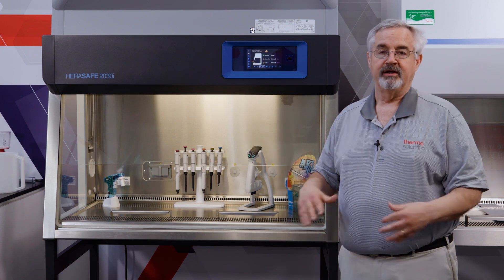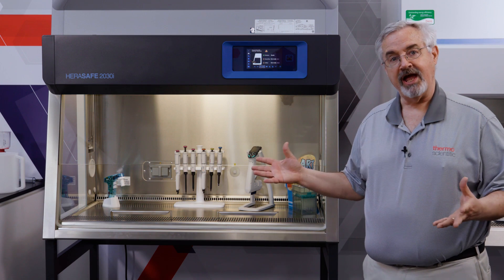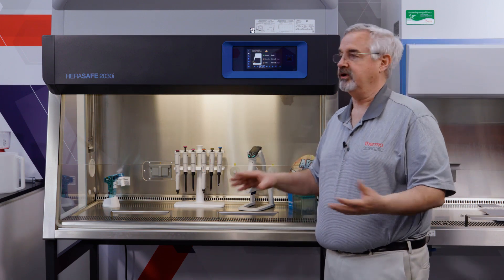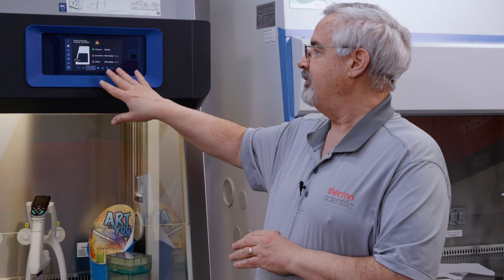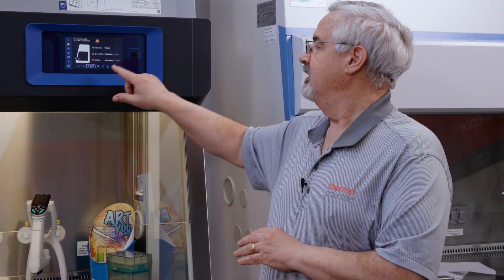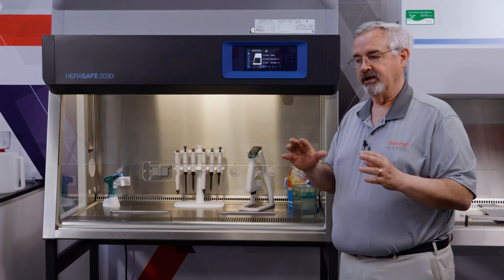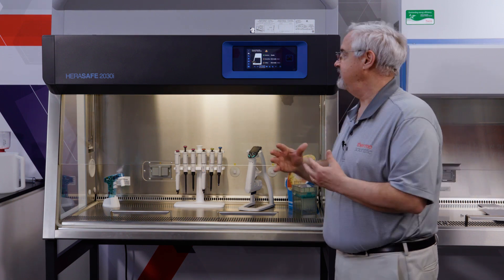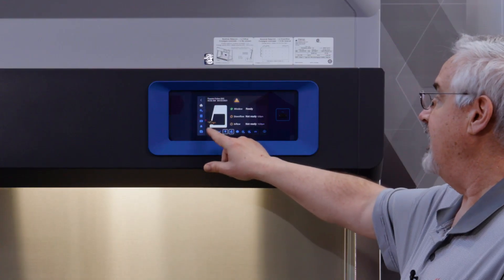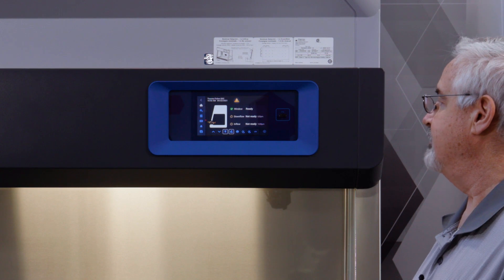When it reaches the proper height it will stop. The internal light will come on and the fans will start up, and everything for this configuration is happening — the cabinet is working. As we look at the display, we see that although the fans are operating, the airflow has not stabilized yet. We see this representation of the air barrier at the front, where the inflow and downflow come together, preventing anything from escaping the cabinet as well as preventing anything from the room from reaching the work surface — still in flux. Downflow is not ready, inflow is not ready. The window is ready because it's in the proper position.